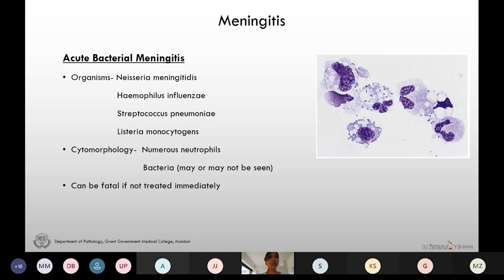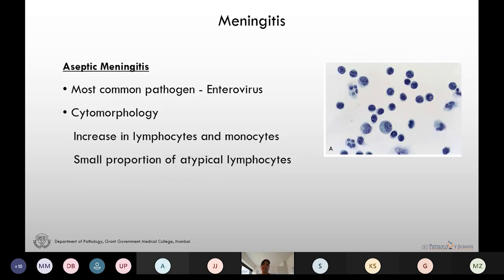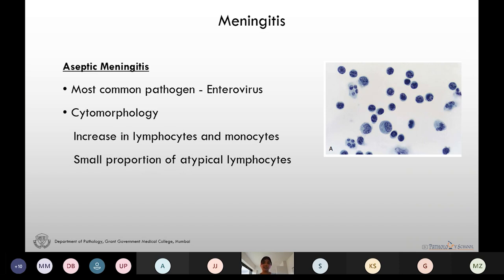Aseptic meningitis is actually a misnomer because it is caused by a wide range of infectious pathogens. The most common pathogen causing aseptic meningitis is enterovirus — including non-paralytic polioviruses, Coxsackieviruses, and echovirus. In aseptic meningitis we see increased lymphocytes and monocytes and also a small proportion of atypical lymphocytes, as we can see here.